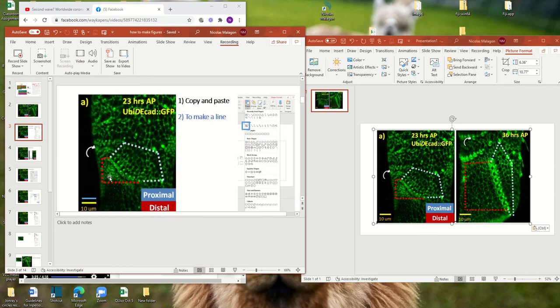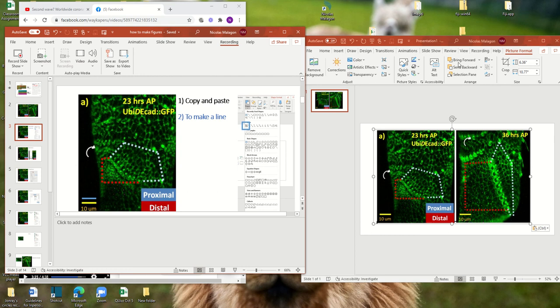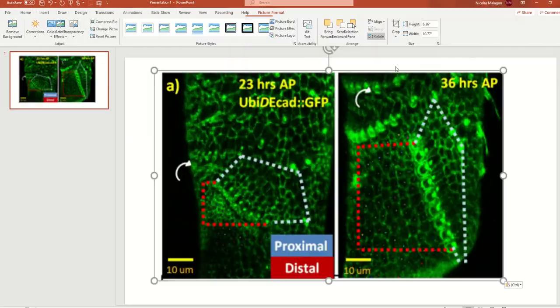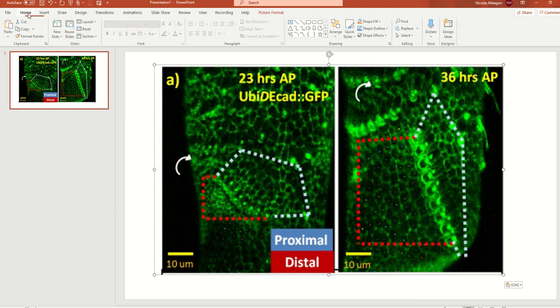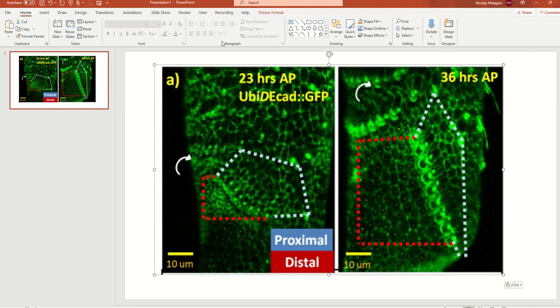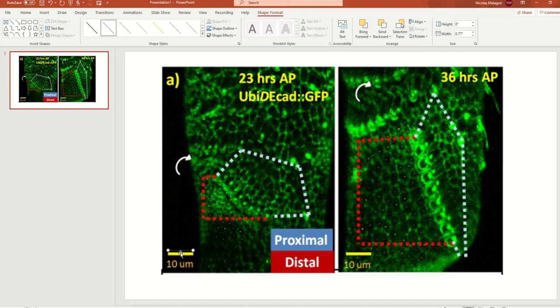And I will send you this PDF. You need to copy and paste. Later, you need to make a line. So how you make a line, I'll show you. You go home, and then after going home, you click here. And suppose that you want to copy this scale bar. So you put it there.